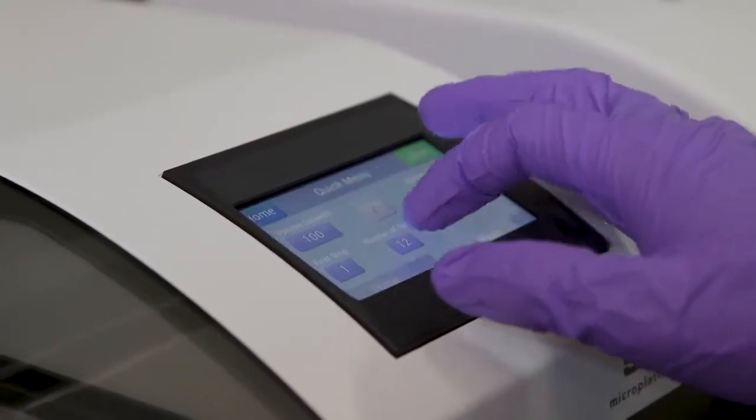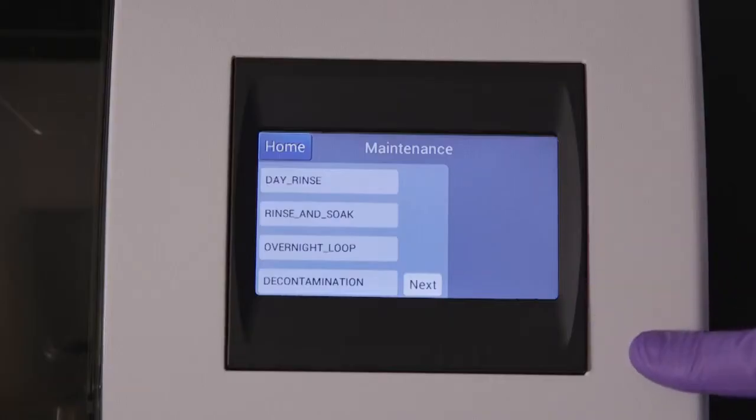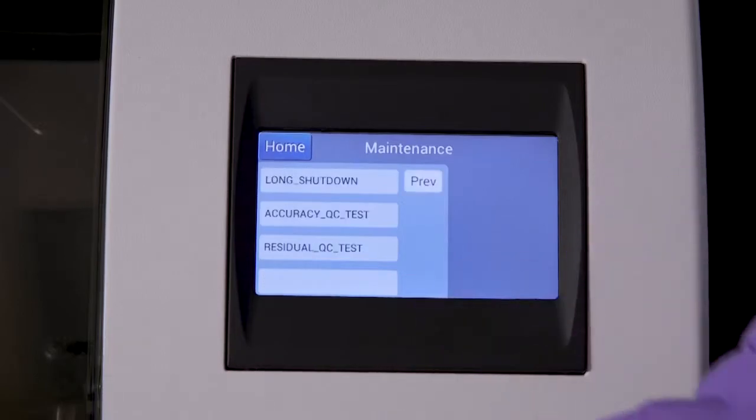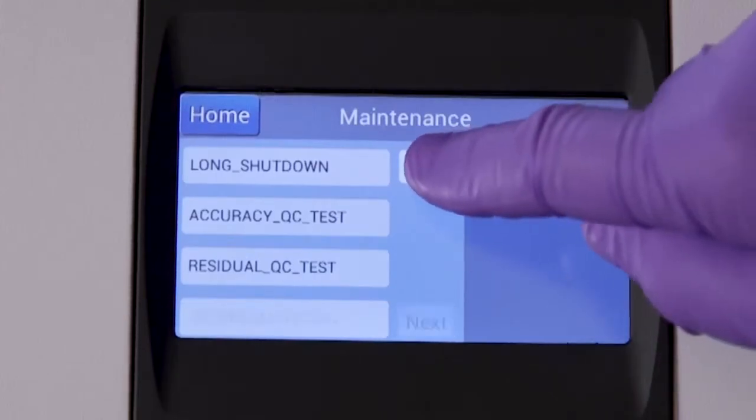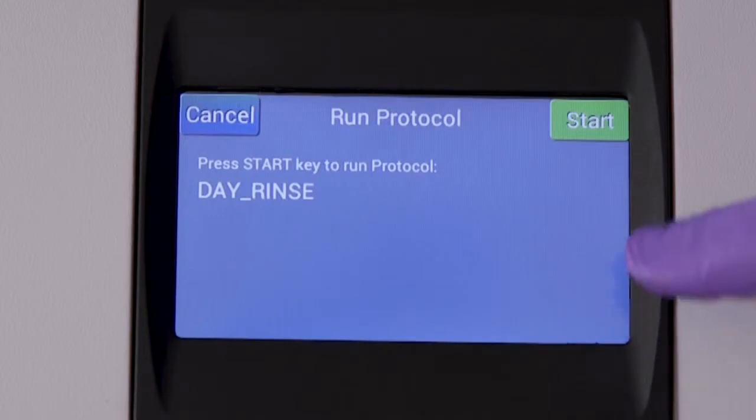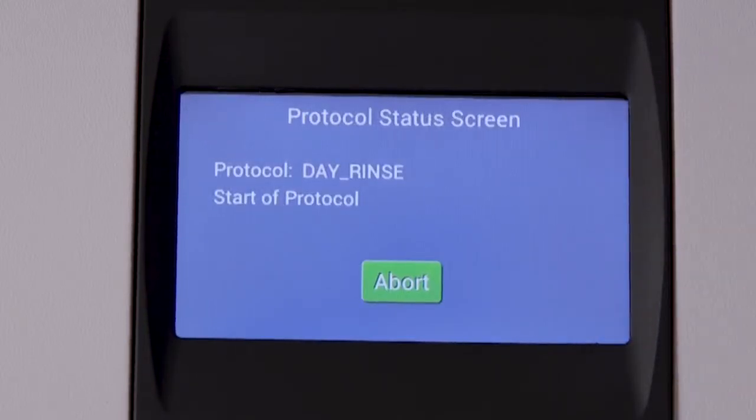Predefined automated maintenance routines, including daily and overnight protocols, keep the fluid path clean and prevent buildup of salt, protein or other material that can block manifold tubes, causing inadequate washing.